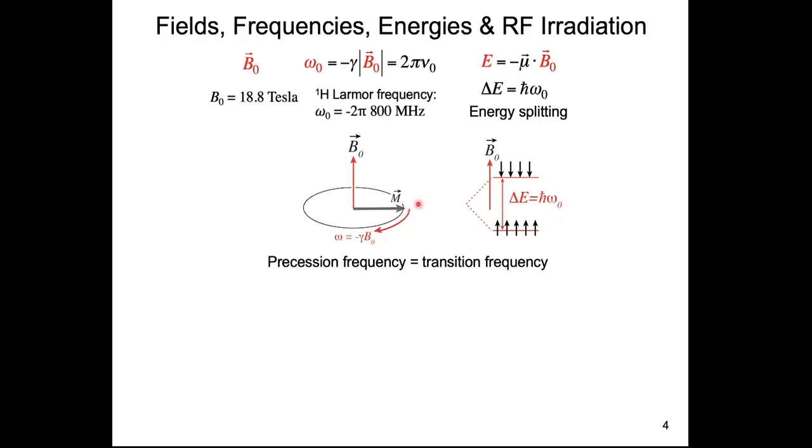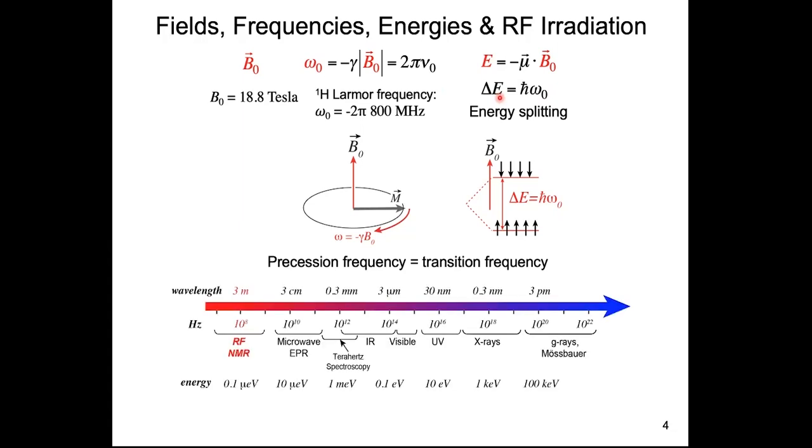So although in NMR, we don't ever do absorption or emission, we don't actually change energy level in that classical sense as for many other spectroscopy, because of this equivalence of the transition frequency and the Larmor precession frequency, what we measure in an NMR coil, this precessional motion, absolutely reflects the energy level. So in that sense, NMR is on par with the rest of the branch of spectroscopy.